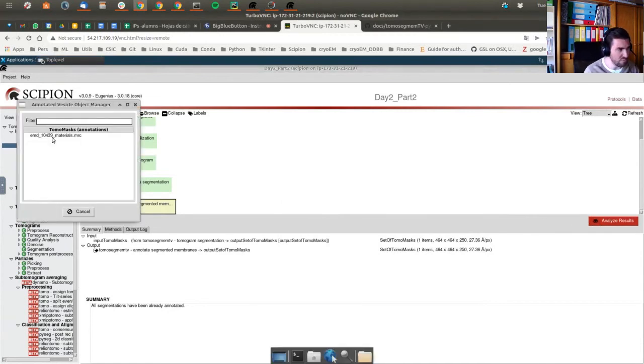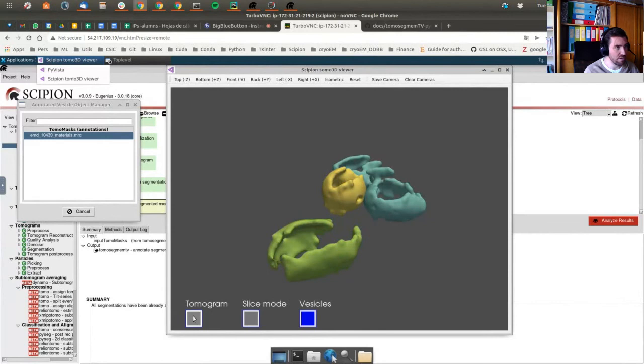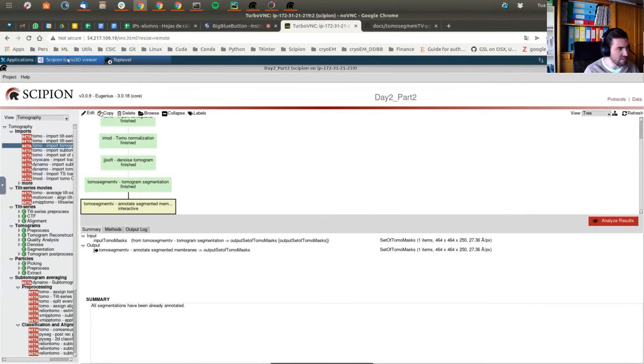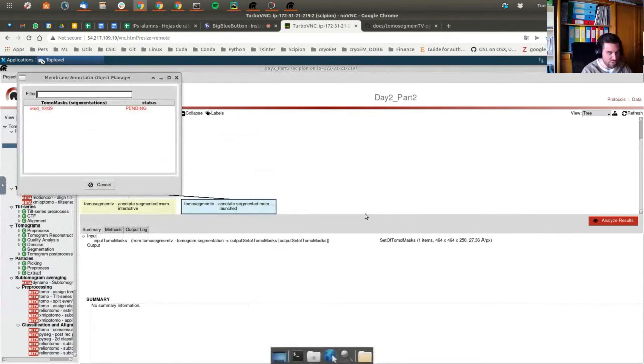I don't know if I am working this correctly. Another possibility is to repeat this step here again, slowly, just to remind the process. Yeah, could be. It's Luca. I am always stuck at the place cursor phase. Okay, so if we repeat from scratch, it would be useful. I'm going to make a copy on this machine and execute it. And we'll do it again from the beginning.